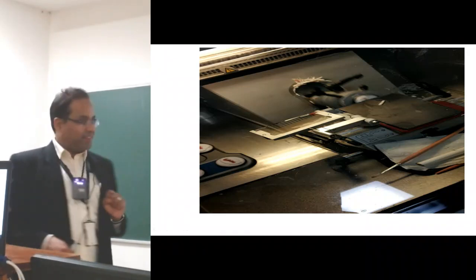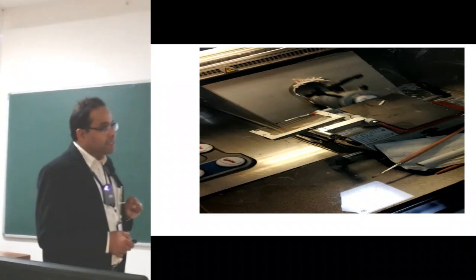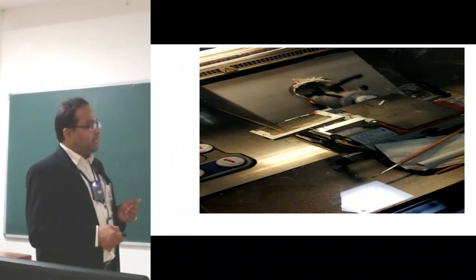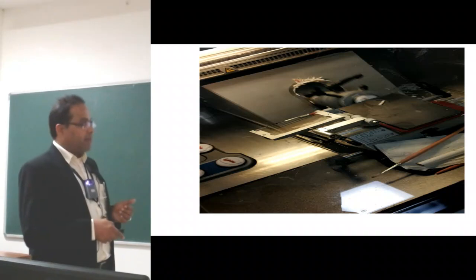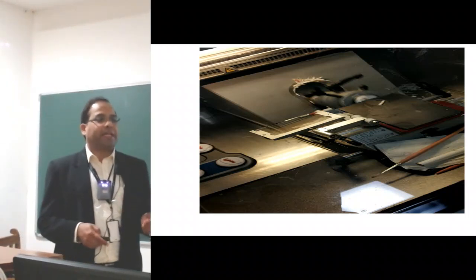So you can see a little bit of a white thing. This is ice containing the tissue, and this is also like a microtome, which advances at regular distances, and a thin section has been cut here, which can be taken up by a glass slide and stained while the patient is still being operated on in the theater.